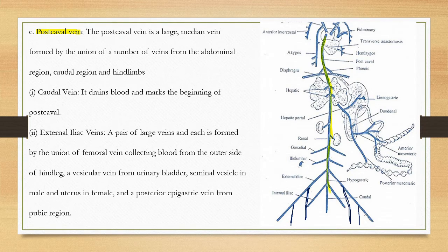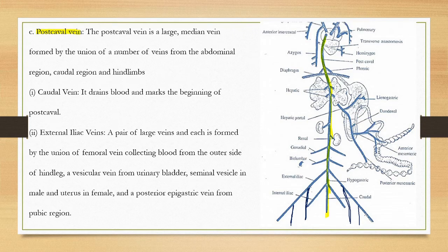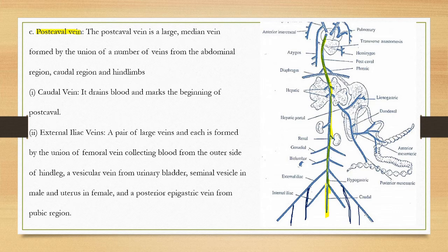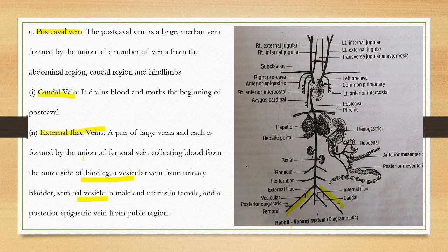This is the postcaval vein which opens into the right atrium. Let's start from here. It marks the beginning of the postcaval. The external iliac vein is a pair of large veins, each formed by the union of the femoral vein.